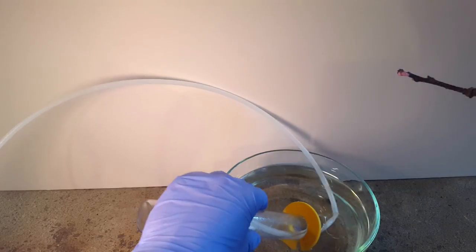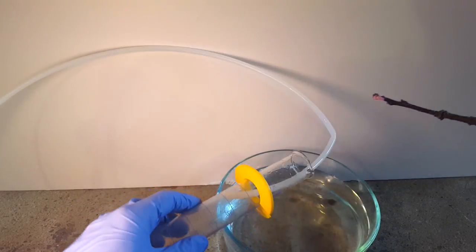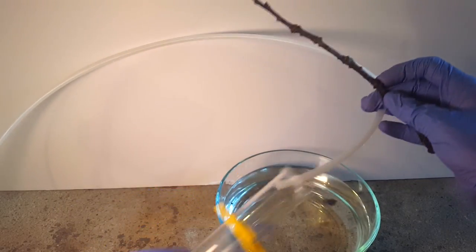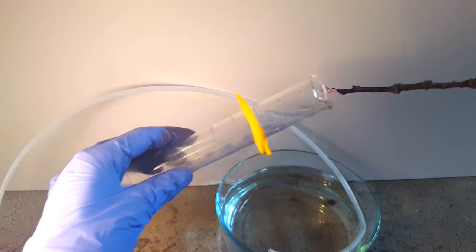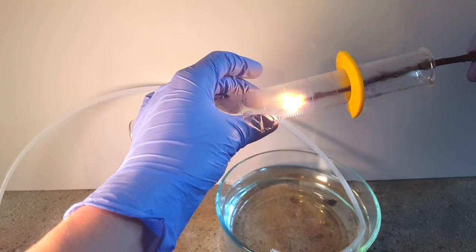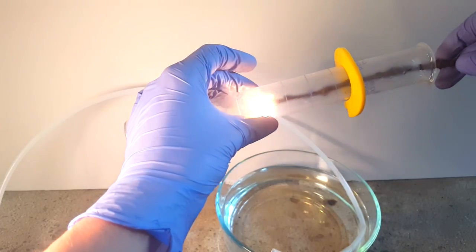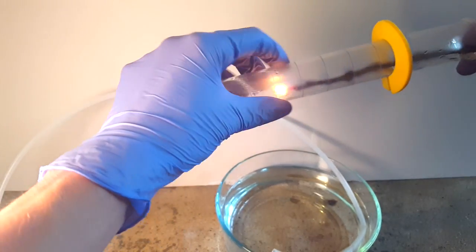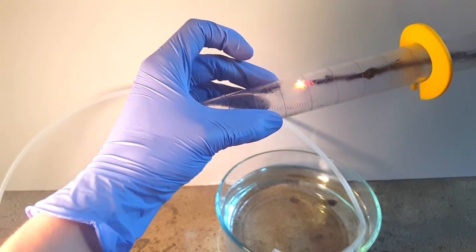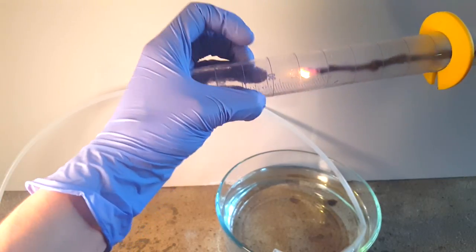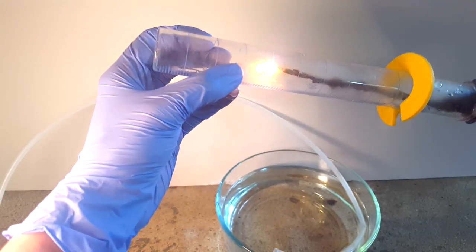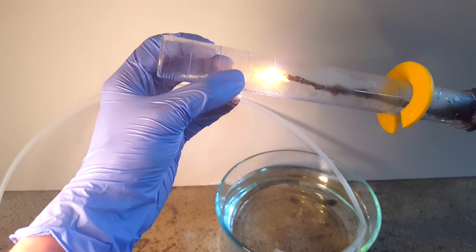To test if this really was oxygen, I took a twig and charred it slightly. Then I placed it into the cylinder to see if the gas had any effect. Obviously it did, as the stick started to glow brightly and burn far faster. You can actually see some of the water vapor building up on the side of the cylinder, due to the complete combustion of the organics in the twig.